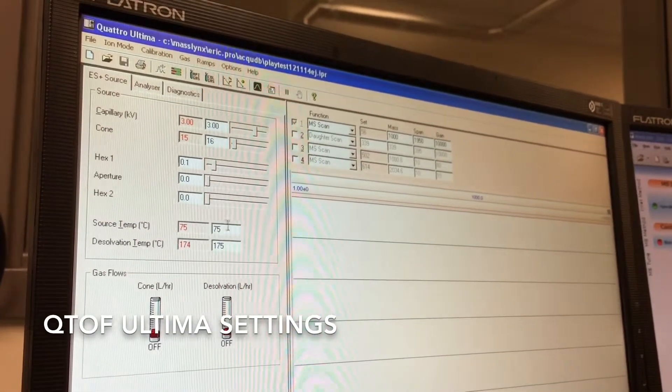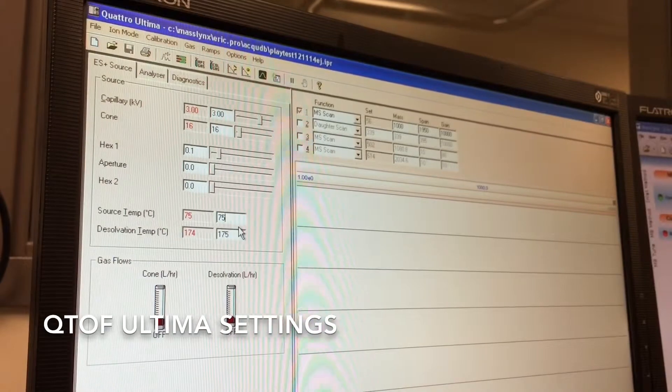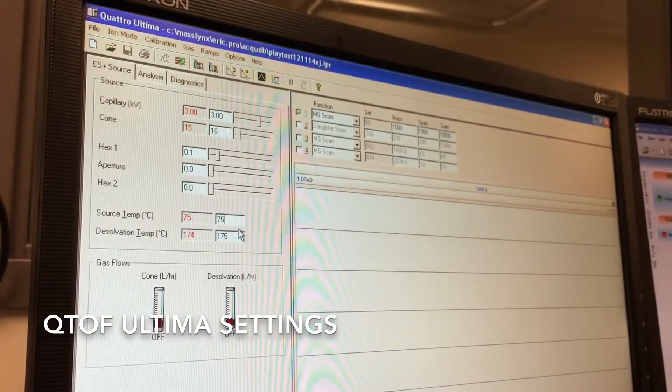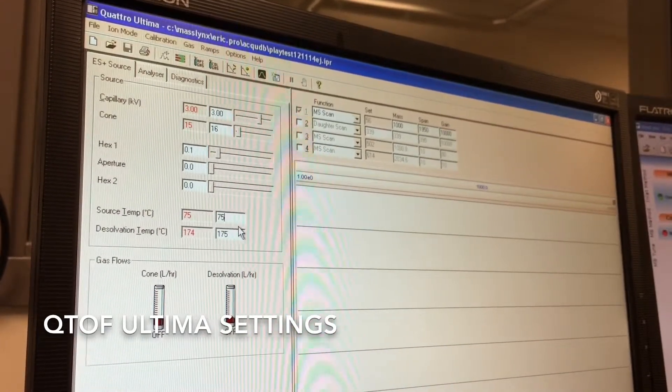The source temperature, you want to be at around the boiling point of the solvent that you're using. For example, if you're using water, set it to around 100 degrees.